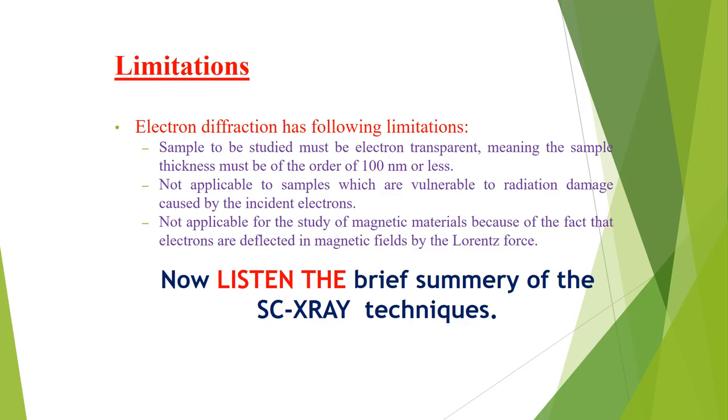In powder XRD analysis, many small crystallites are randomly oriented, and the diffraction condition is met at spheres in 3D reciprocal space, isotropic. It measures in one direction, or point or strip detectors are used.